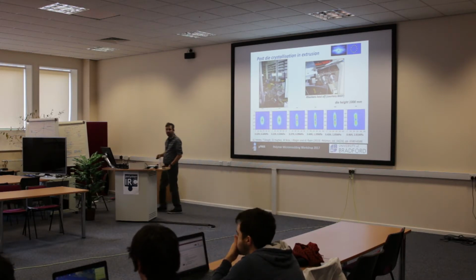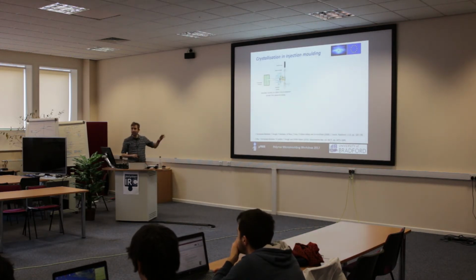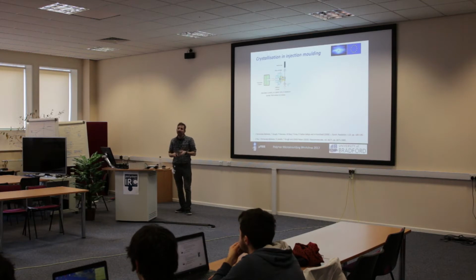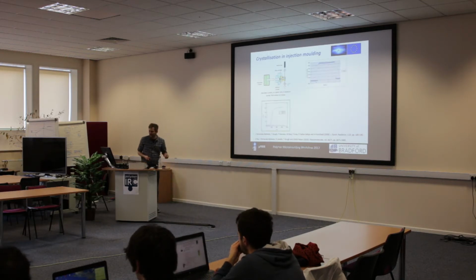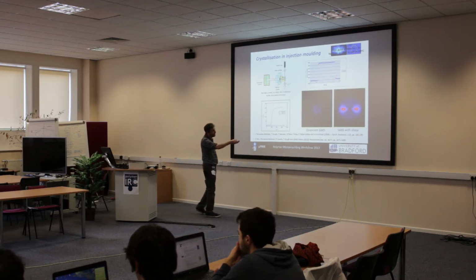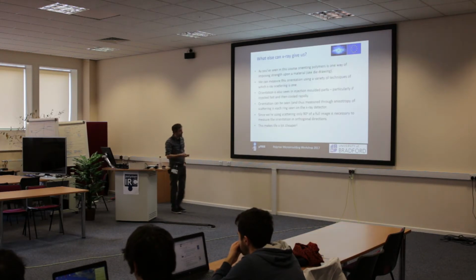Now I say this because we're cheap. Our cameras are 150,000 euro now. If you buy a full detector, that's 500,000 euro. That's a lot of money, so we didn't have that. But what you can see is just by getting 90 degrees, you can get an image out.